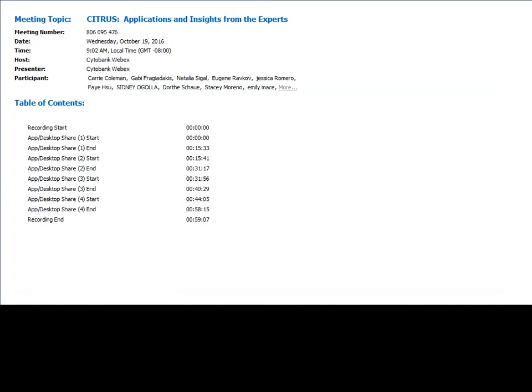Hi there, everybody. Great to have the opportunity to speak with you all today. And I have to say, watching the ways people apply Citrus in new and interesting ways is actually probably the most rewarding thing about having done graduate research in the first place. So I'm excited to see what people learn in the space and how they apply things.